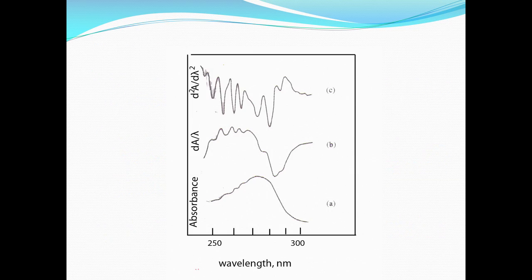So, here I am showing you the absorbance spectrum. The first one is the bottom one.